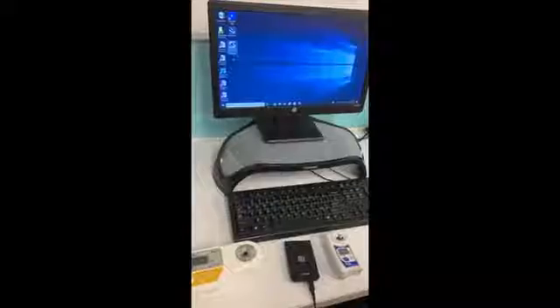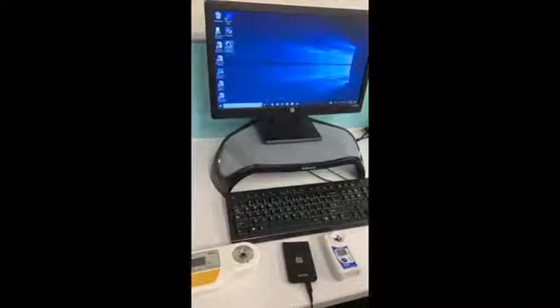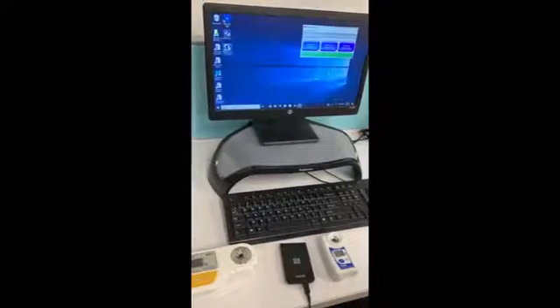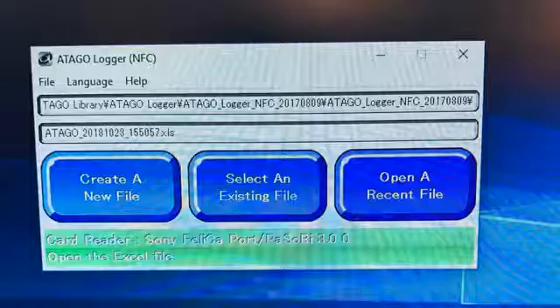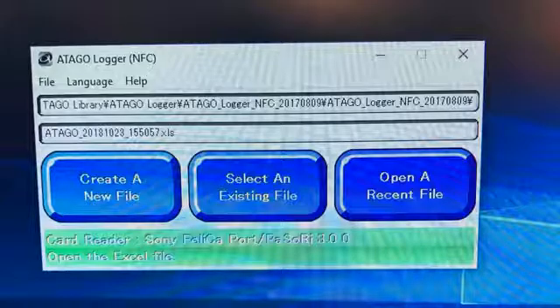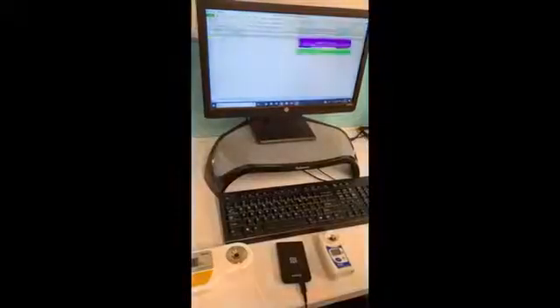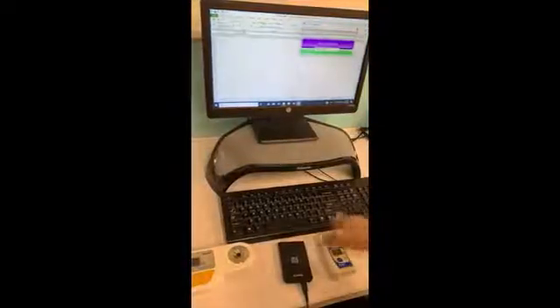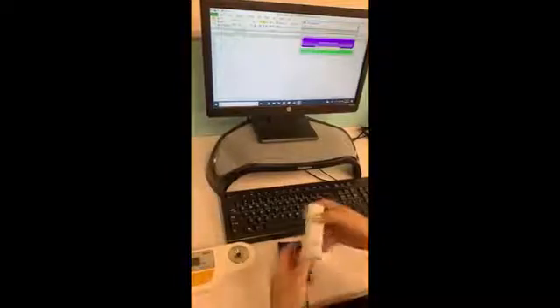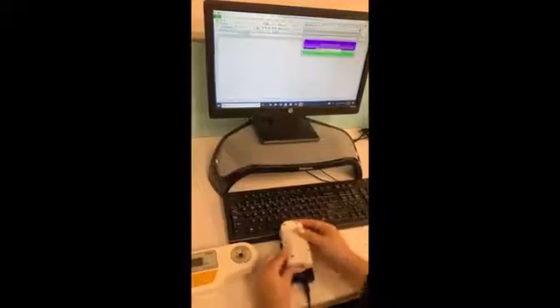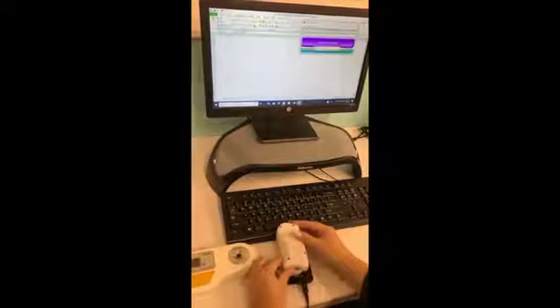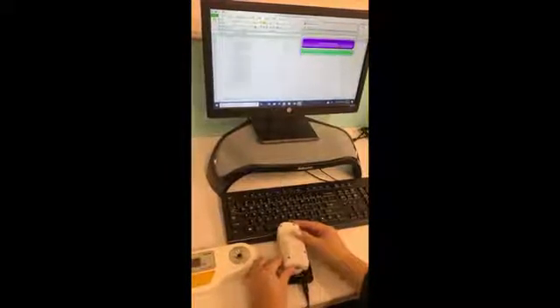Plug in your reader writer to the computer and launch the Atago logger. Click on the button that says create a new file, then just place the Atago unit on top of the reader writer and slowly move it around until the unit has been acknowledged. After that, your data should show up immediately.